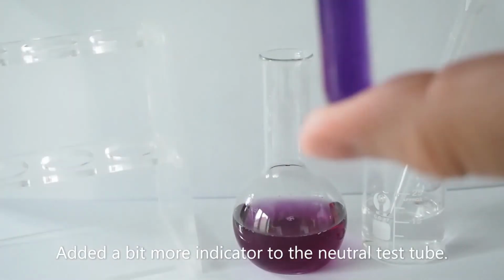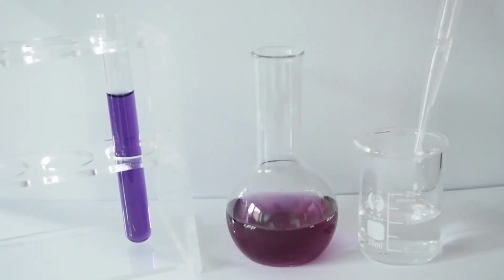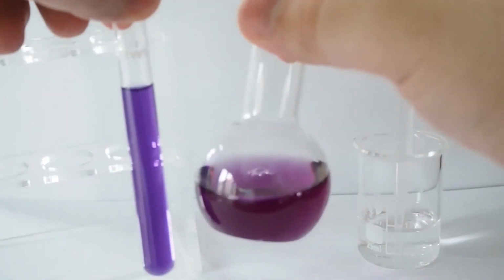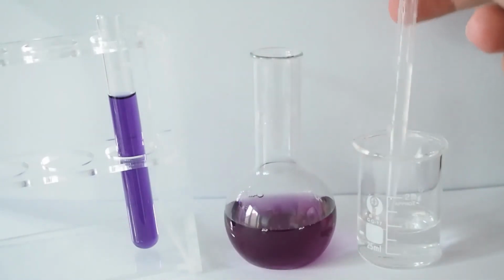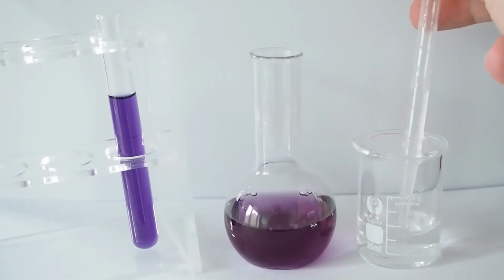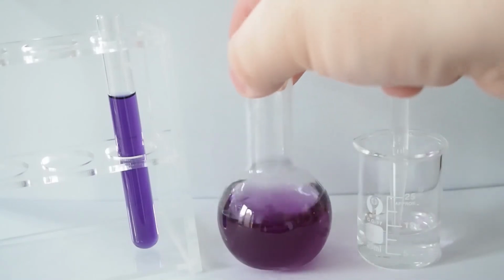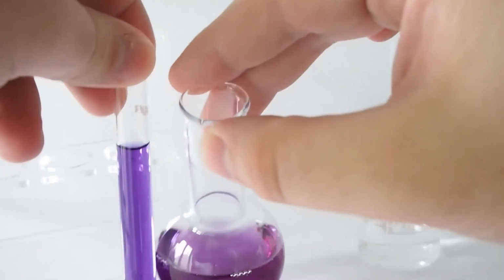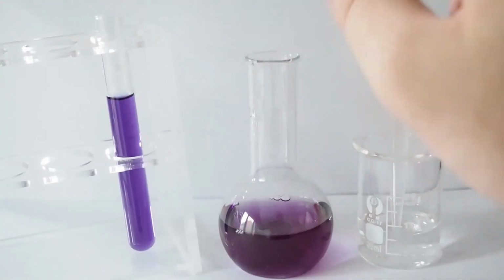Oh, I had to add a bit more indicator because my neutral solution was a bit paler. And you'll see when I stop the titration on the camera, it still looks a little bit purpley in the reaction vessel. And this is now the 8th addition. This is 8 millilitres of that 0.5 molar base solution. And that is done. We've got it to neutral, so we know we needed 8 millilitres.